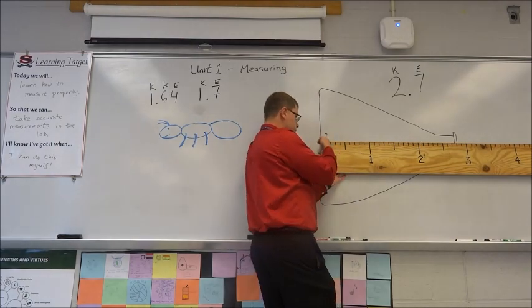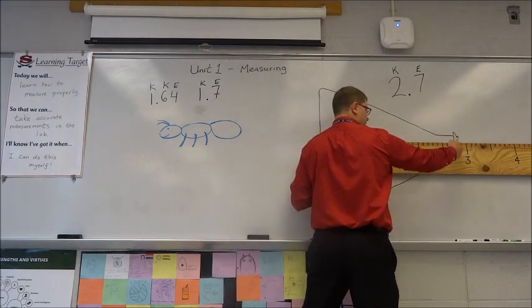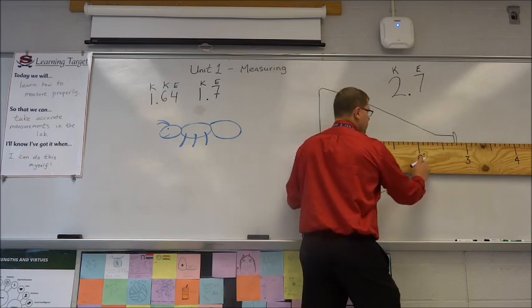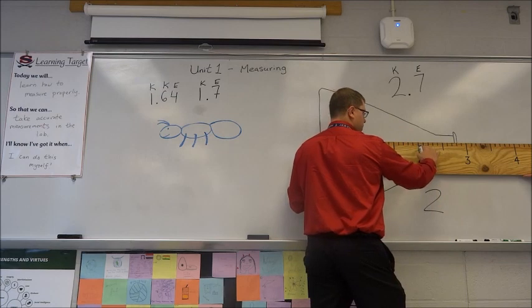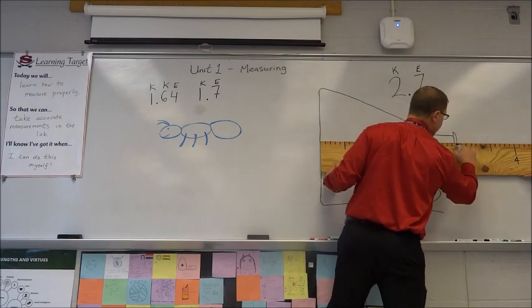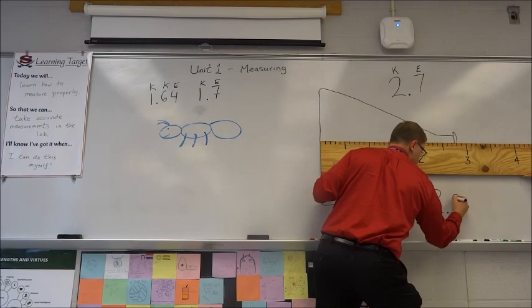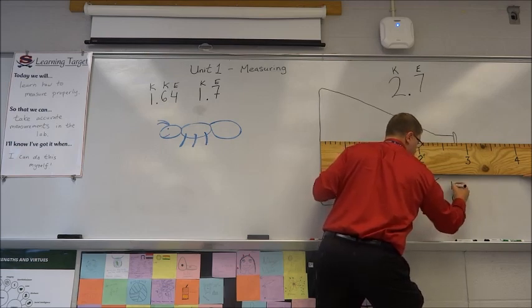And if we do the same thing, we start the ruler at where the 0 mark is, and we look, we have a whole lot of different graduations here. So we can, again, measure it. We know that it's 2, and we can count: 0.1, 0.2, 0.3, 0.4, 0.5, 0.6, 0.7, 0.8. It's longer than 2.8, so it's at least 2.8. These are our known digits.